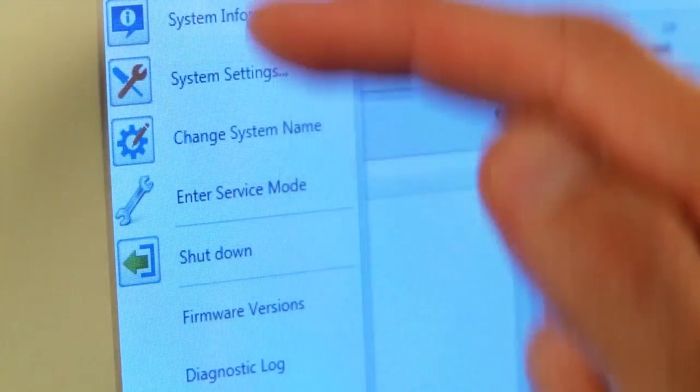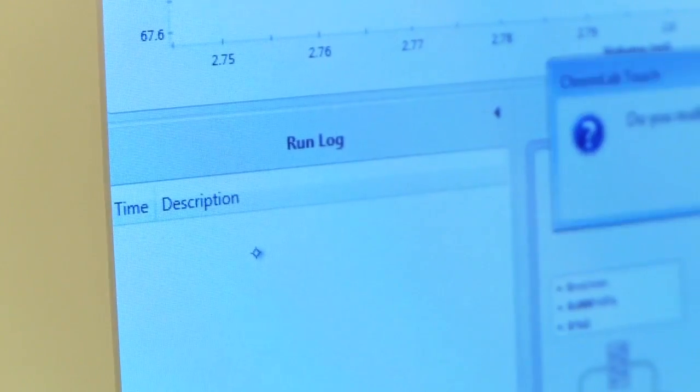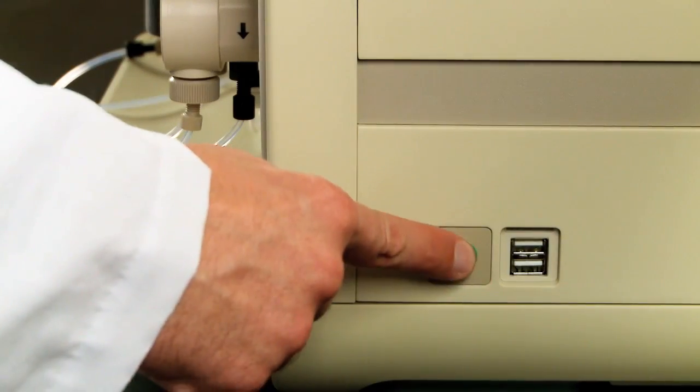Shut down the NGC instrument using either the Chrome Lab menu on the touch screen or the power button located on the side of the instrument.